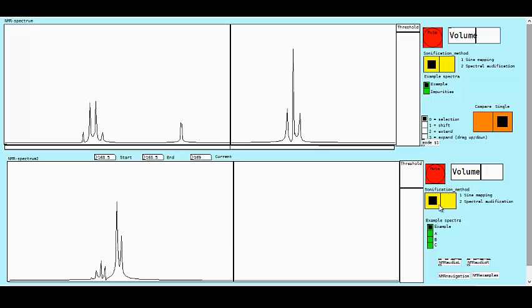Hello and welcome to the video demonstration for our final system in PD for the project Chemical Spectral Analysis through Sonification. Here we can see we have two NMR spectra, one here and one here. To compare, we can add a single comparison mode. Single mode here will just play through our top spectrum. Comparison will play one in each here.